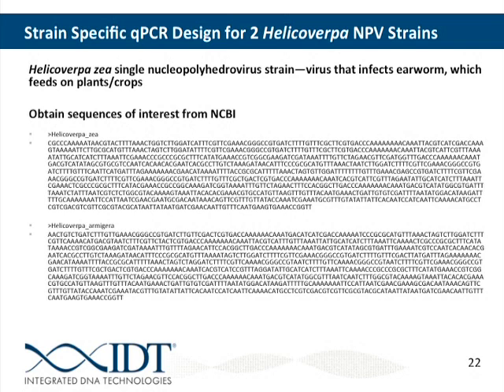I always start by looking for those gaps, so portions of sequence that are present in one and not the other. There are also regions that just are highly dissimilar. And so for this first example, we're going to select this region here and design to this top sequence so that it's specific for that and doesn't recognize zea.